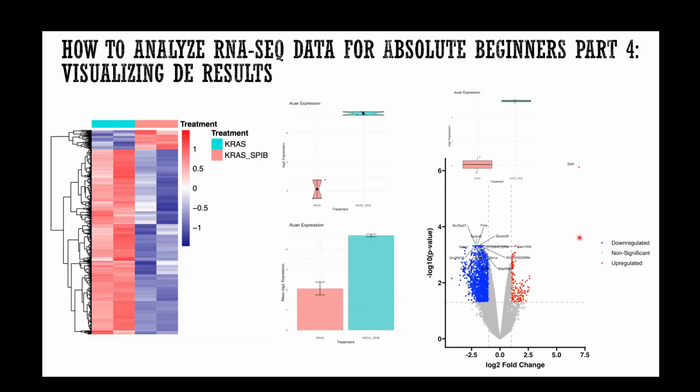In the last video, I showed you how to perform differential expression analysis. In this video, I'm going to show you how to visualize the DE results. Basically, I'm going to show you how to make volcano plots, heat maps, bar plots, violin plots, and box plots.